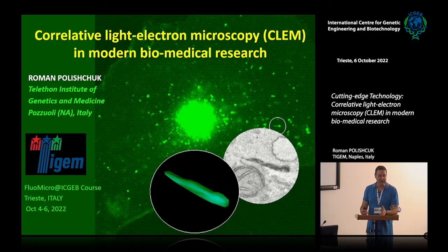You know, what we did and how we used correlative light electron microscopy, which is a fantastic technology with which one can see the structure in a living cell and then see how this structure looks under the electron microscope and make its reconstruction with really, really high resolution.